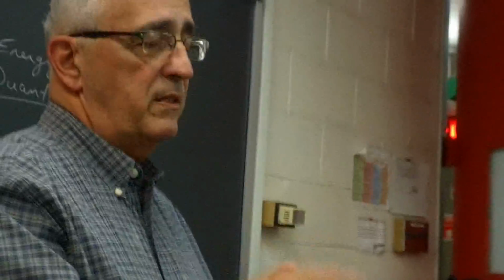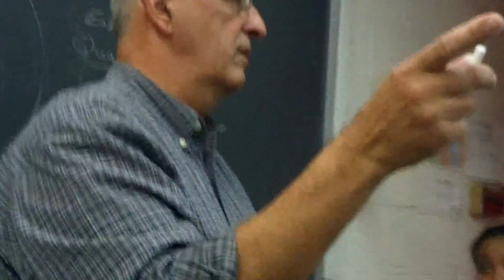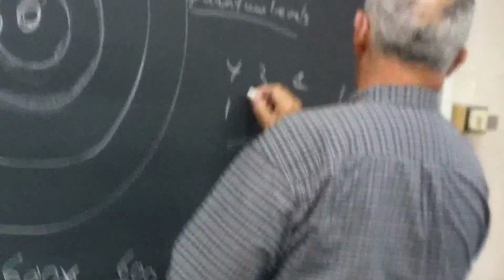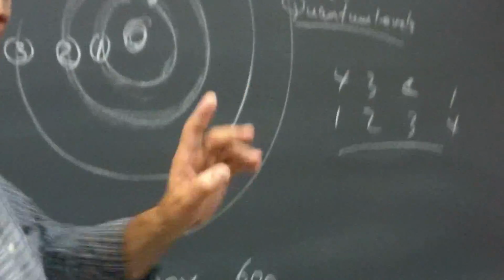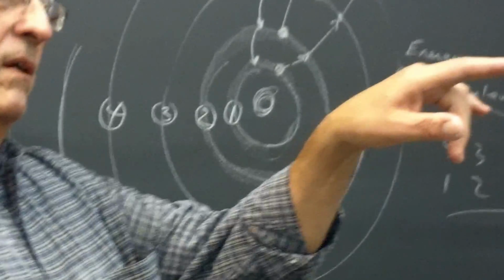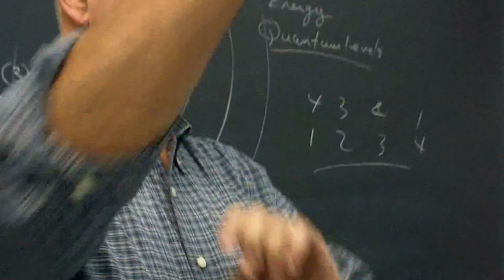Now the difference is, it depends upon who manufactures the instruments and who manufactures that chart. The difference is that the scales are reversed. So if you look at that scale, we normally write left to right, so the low numbers are on the left and the high numbers are on the right. That chart on the back wall is the reverse, right? It's not like 500, 600, 700, etc. It goes down the other way. So just make sure that you understand that the charts are going to be reversed. The only reason why you want to look at that chart is to make sure that you see in the instrument the same results as published by scientists throughout the world.